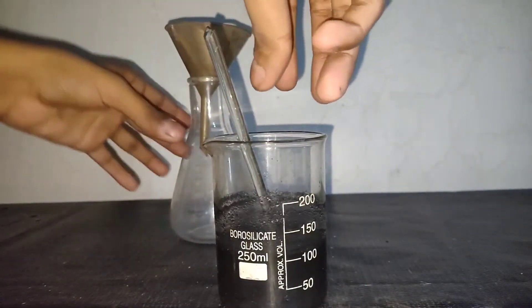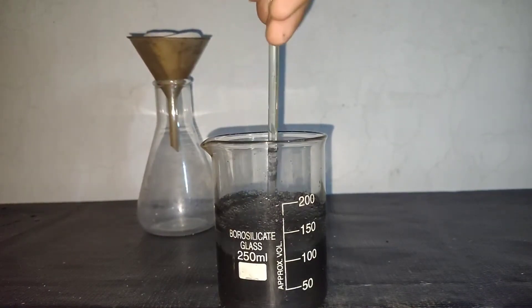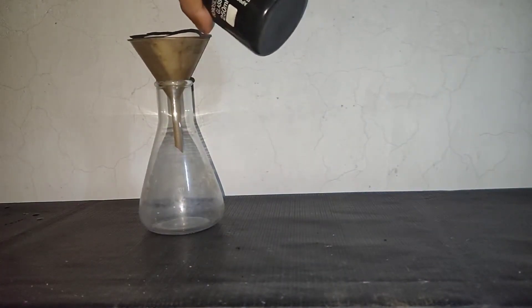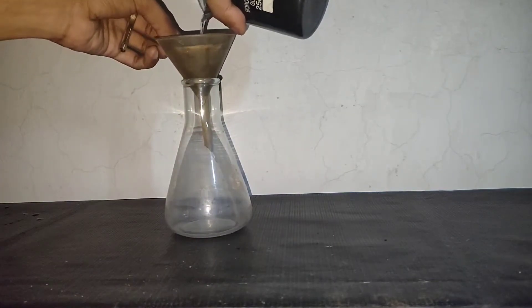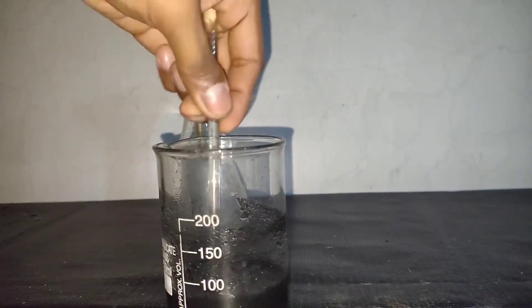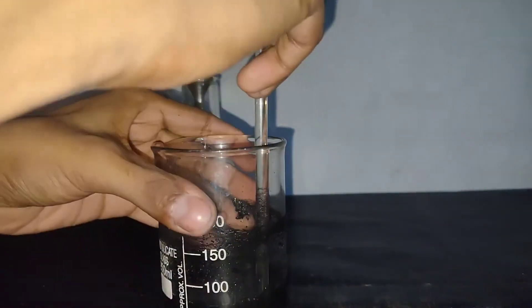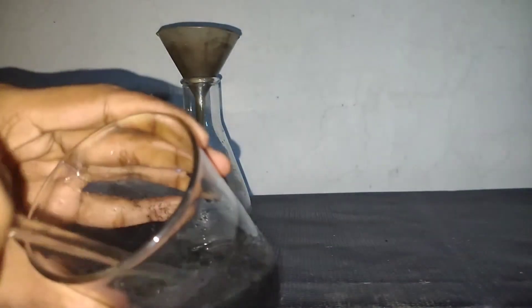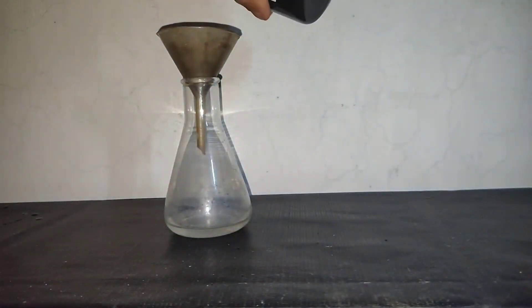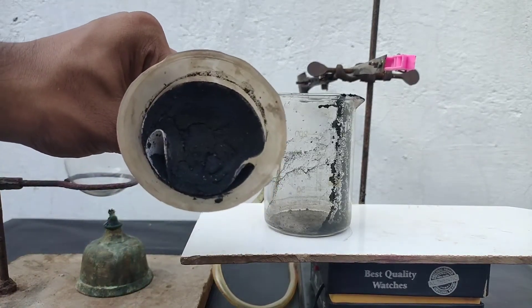After about 1 hour, I decided to filter it. I am using regular gravity filtration. The solution filtered off very quickly and didn't take a lot of time. I also washed the precipitate a couple of times with water to remove all the soluble material — I didn't show the washing, but I did do it. This black precipitate consists of carbon and manganese dioxide.